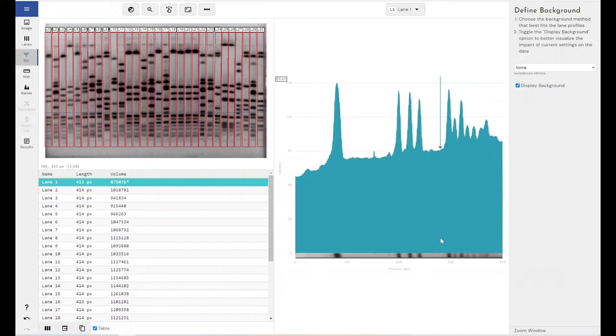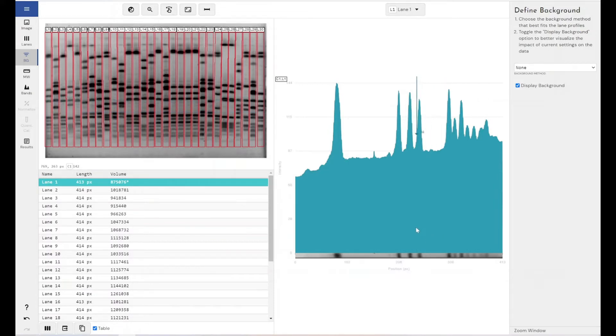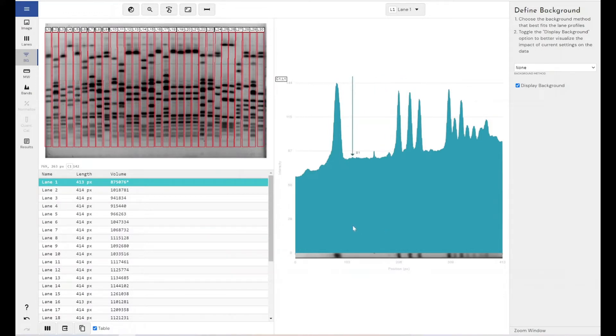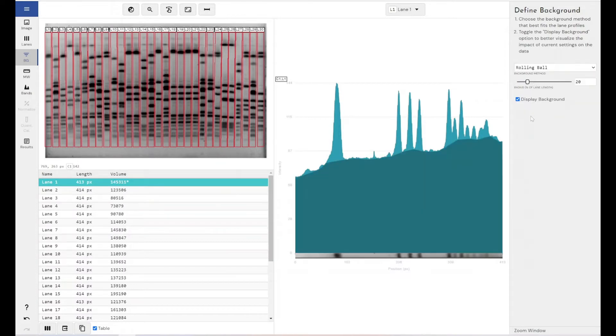So what we need is a background removal technique that is adaptive to some degree. It can adapt to the changing background within our image, but without losing the sensitivity for the bands that we have. And for that, this is the reason why we recommend using rolling ball.